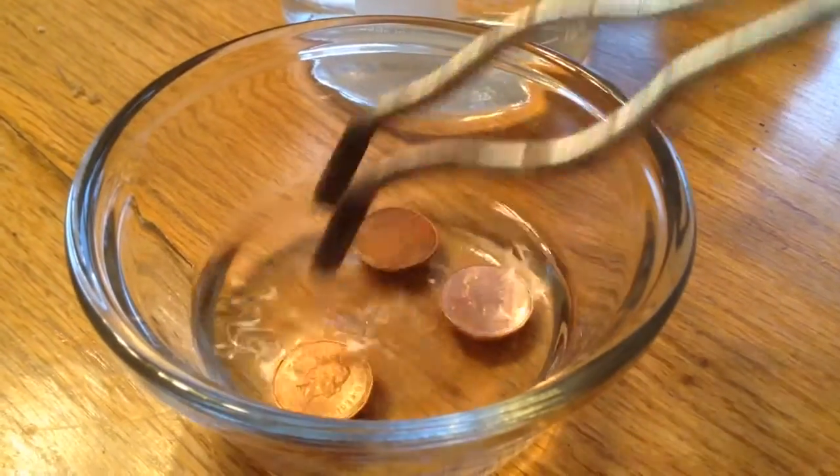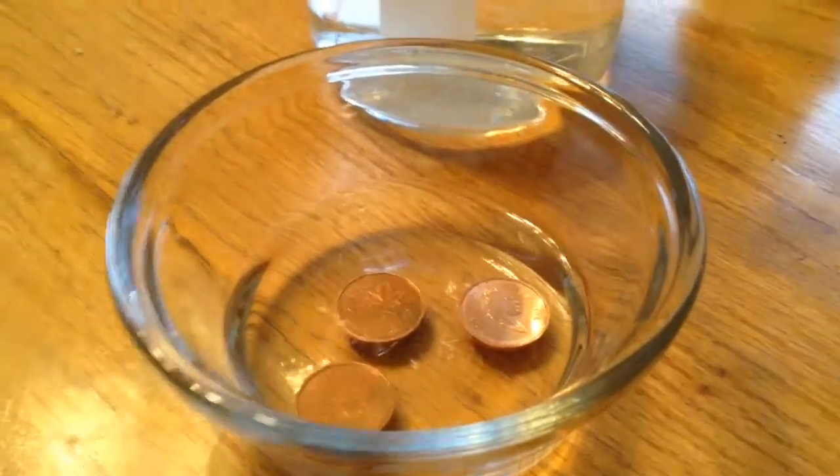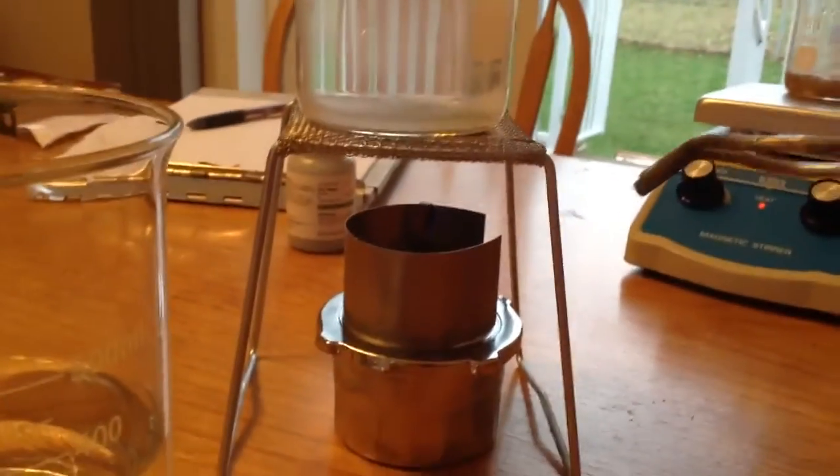So what we have here are some pennies, just getting cleaned up by soaking them in some vinegar, so it's an acid. This is just water — I could drink it if I wanted to. This is lye and a little bit of zinc at the bottom, and then an alcohol burner to keep it all warm.